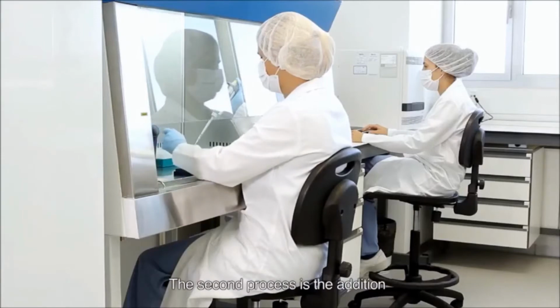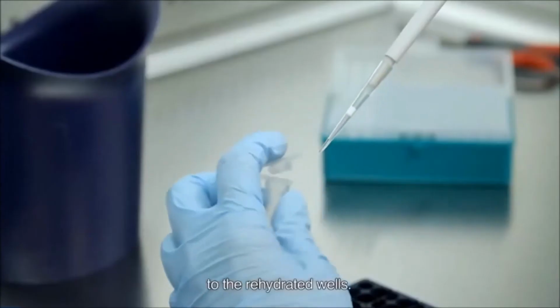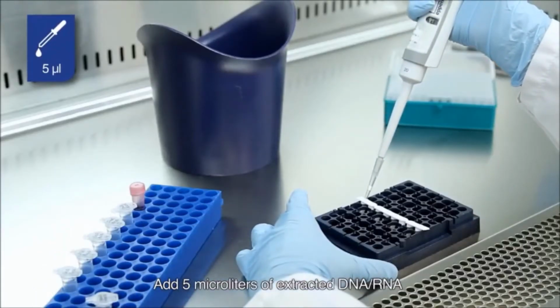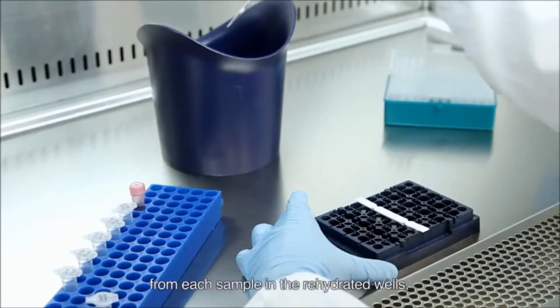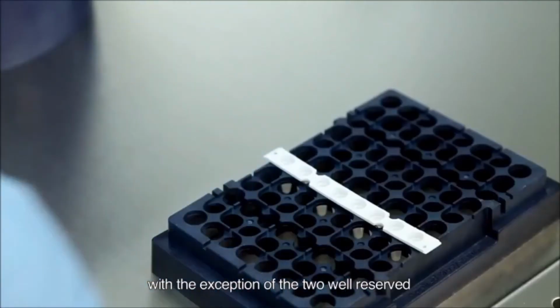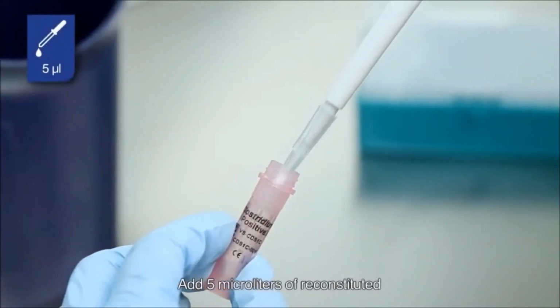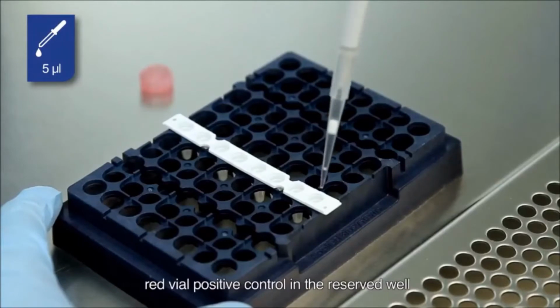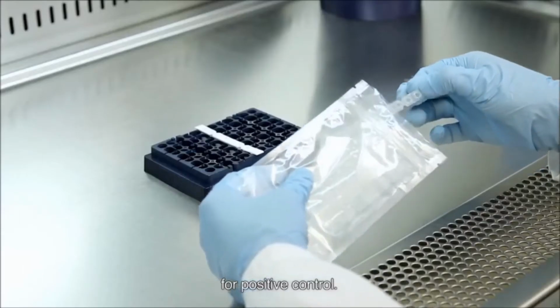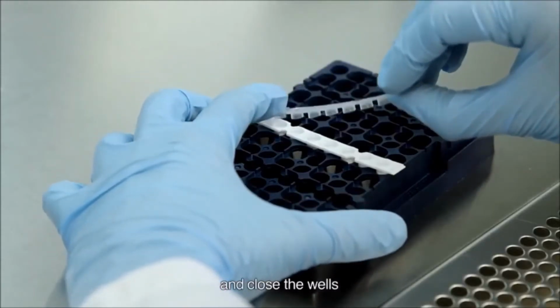The second process is the addition of the nucleic acids and positive control to the rehydrated wells. Add 5 microliters of extracted DNA, RNA from each sample in the rehydrated wells, with the exception of the 2 wells reserved for the positive and negative control. Add 5 microliters of reconstituted red vial positive control in the reserved well for positive control. To finish, divide the required optical caps number and close the wells.